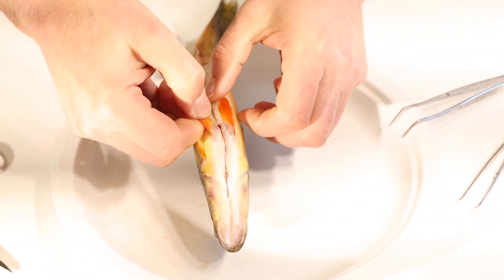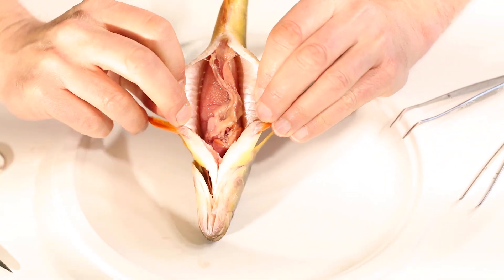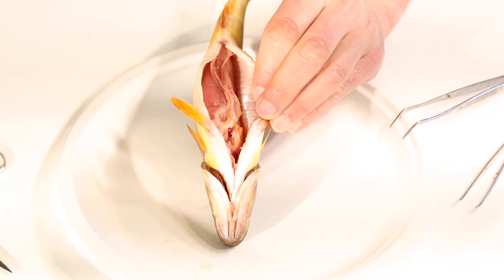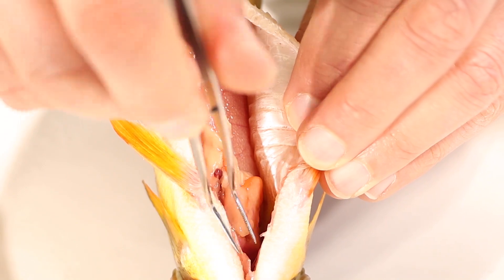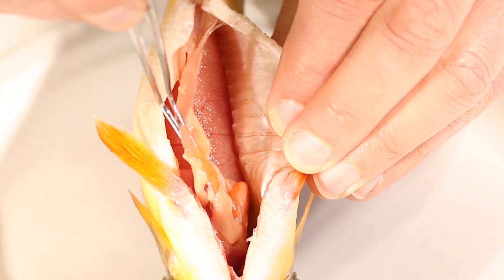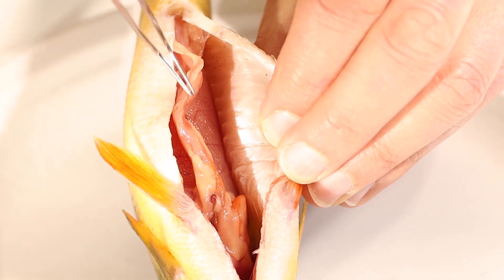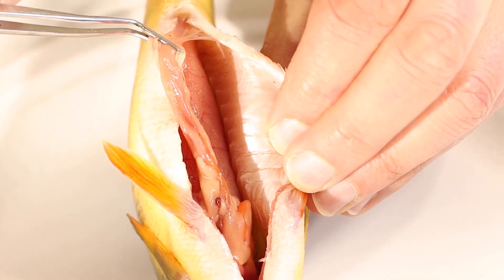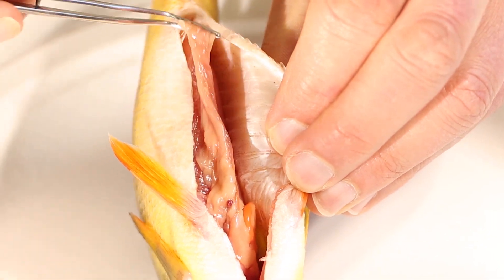Now we've got the cut made. We're going to pry things open and look initially at the internal organs inside of the fish. The first thing we see right on top is this tube that runs from the digestive system at the front back here to the vent — that is the large intestine, the end of the digestive tract. When the food is all used up, it passes out of the body as fish poop right out the vent.